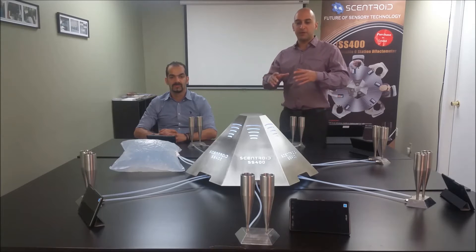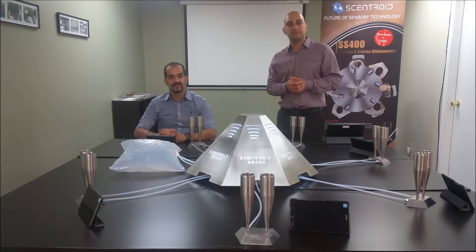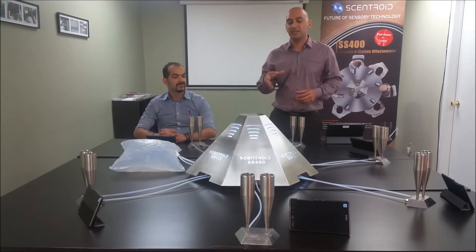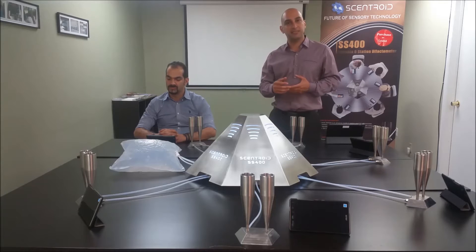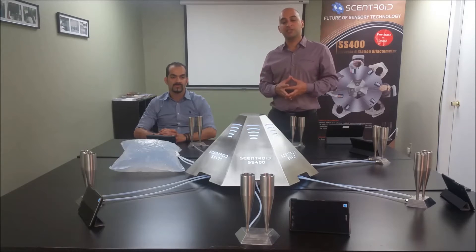So what is this product that you see in the middle? This is a portable six-station olfactometer, meaning that it is for a lab. It's designed to do a six-station odor measurement in accordance with the EN standard, the VDI standard, and ASTM standard.